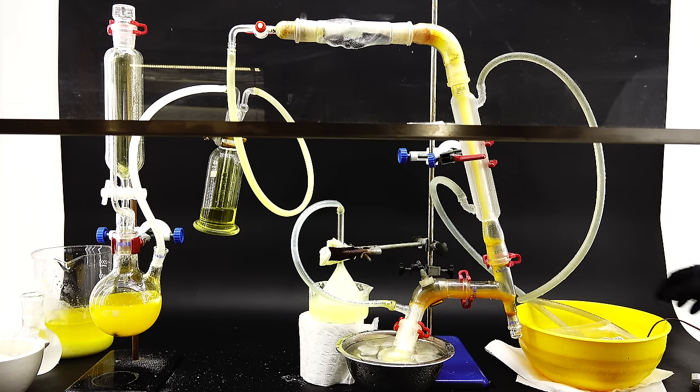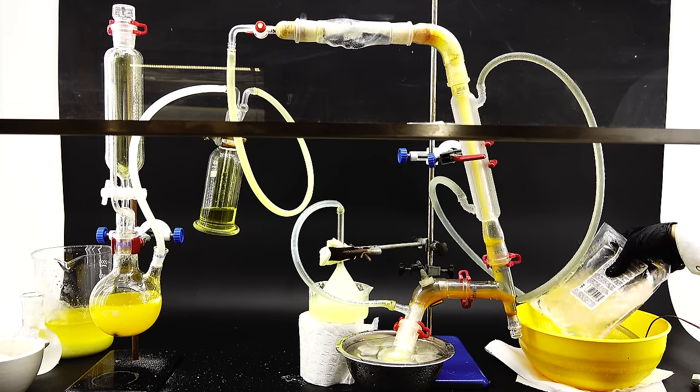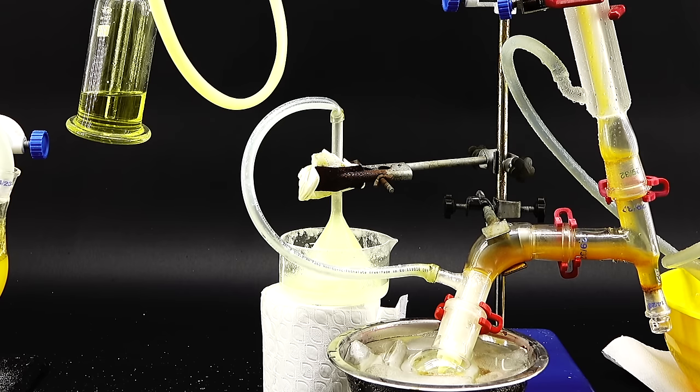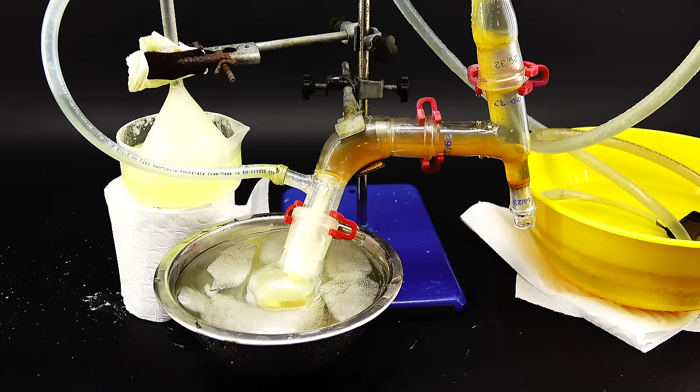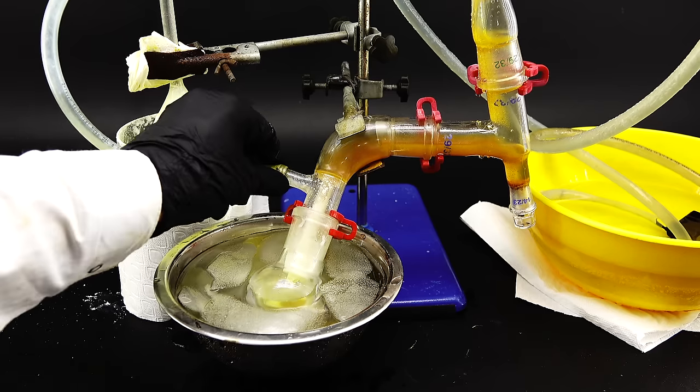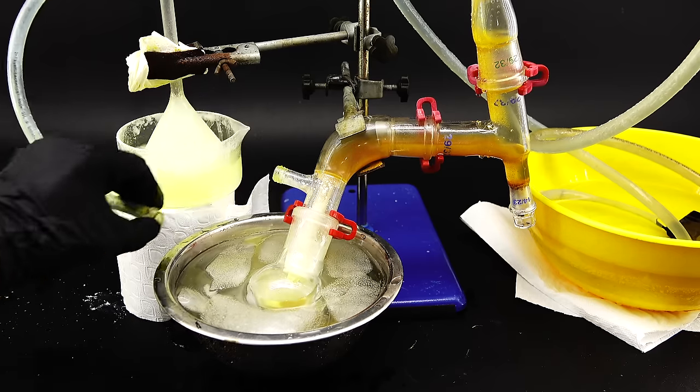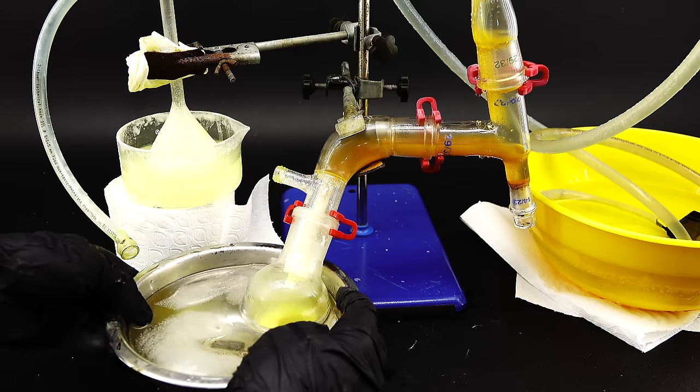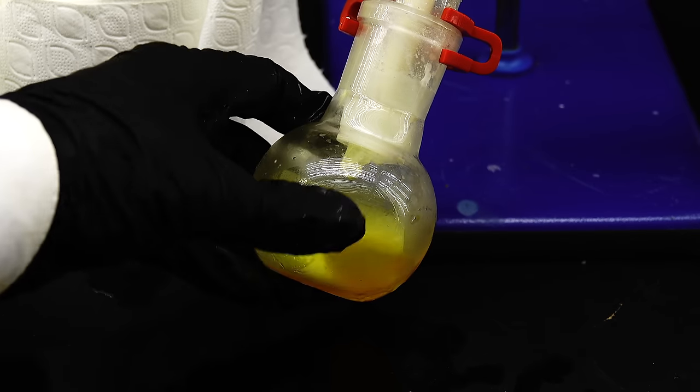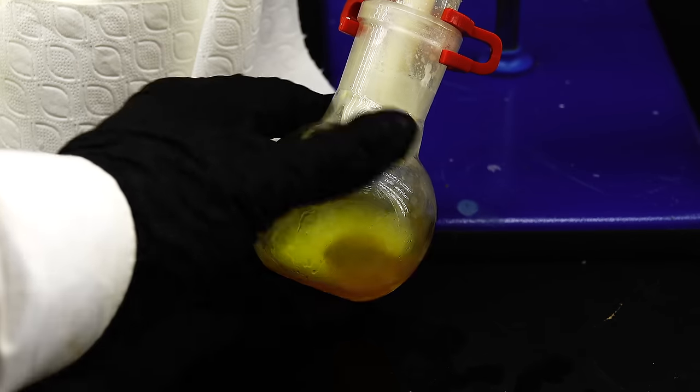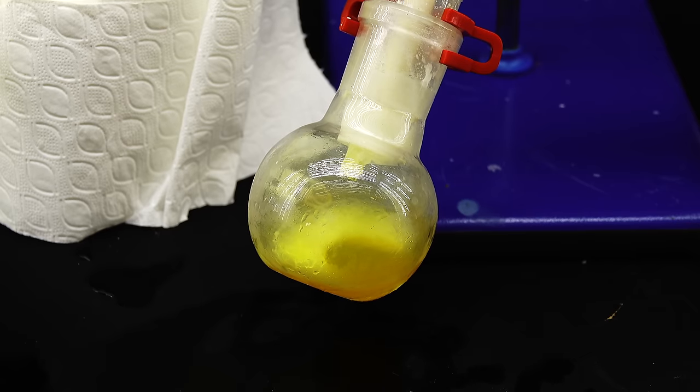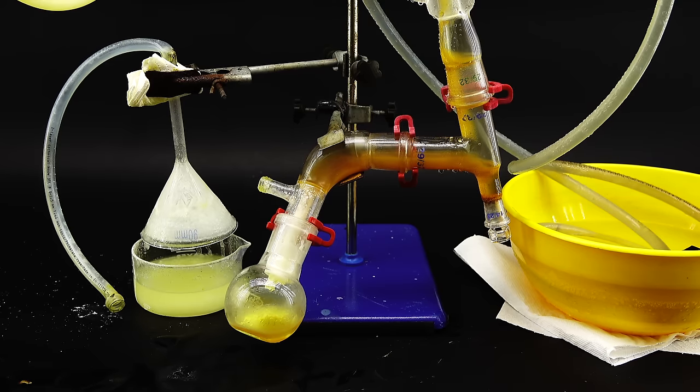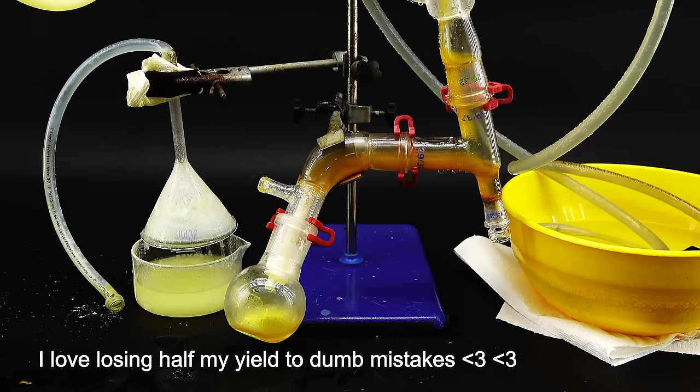I then started to slowly disassemble the whole apparatus which kept me occupied to the point where I didn't notice the pressure inside the apparatus slowly drop and suck in the water from the trap. Once I saw that it was a little too late and a bit of water got into the receiving flask containing my precious product destroying most of it which made me pretty darn angry. I didn't record the exact moment when this disaster happened but you can see that there is now quite a bit of the silicon dioxide paste in the flask and since this is pretty much just ultra fine sand I have officially found the most labor intensive way to make it.